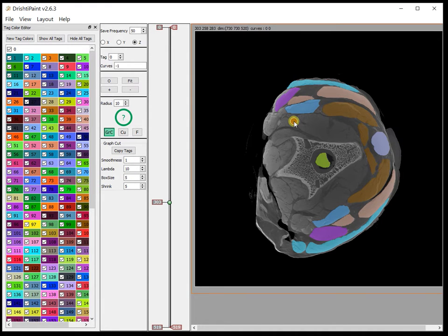So what we will do is shrink and shift the tomogram such that it fits within say from 160 or 170 onwards.